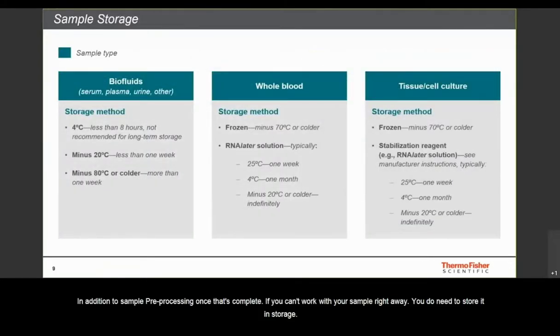In addition to sample preprocessing, once that's complete, if you can't work with your sample right away, you do need storage. And storage can be very important. As we know, RNA in general, even microRNA, which is often protected by exosomes or protein complexes, is very prone to degradation. And of course, degradation will interfere with the true expression pattern and interfere with your downstream analysis. And so storage is important.